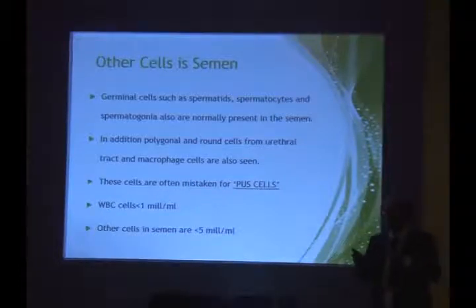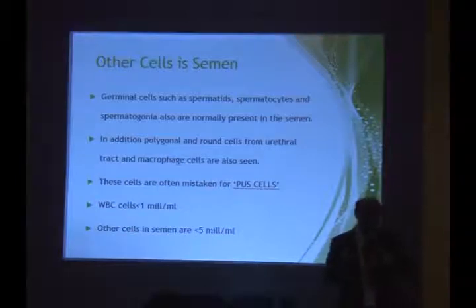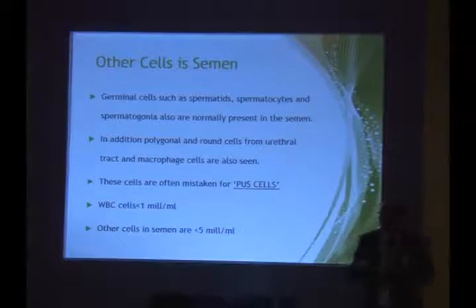Now people confuse an occasional pus cell in the semen with an occasional pus cell in the urine. They forget that in urine you are taking a 10 to 15 ml sample, centrifuging, and then reporting that occasional pus cell. When you report an occasional pus cell in the semen, even an occasional pus cell corresponds to 1 million because you are using an uncentrifuged specimen.